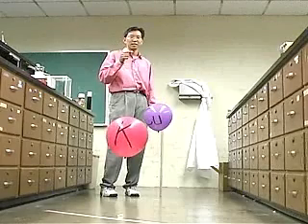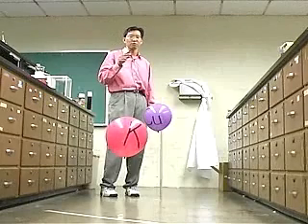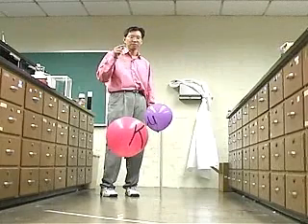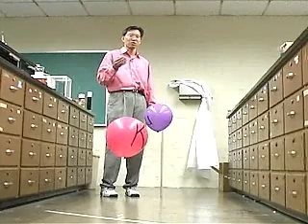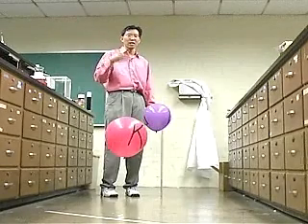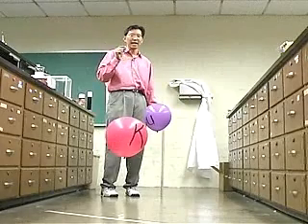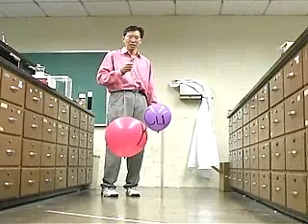We know that the energy levels in atoms and ions are quantized, and that quantization gives rise to light being emitted at specific frequencies or wavelengths when the atoms relax from their excited state to their ground state. So again, it's the excitation energy from some exothermic reaction like gunpowder blowing off, exciting metal atoms. Then those metal atoms relax, and the energy changes are specific to the metal atom, and so you get only particular colors coming out, and those colors are characteristic of the atom, and they give rise to the pretty colors in fireworks.